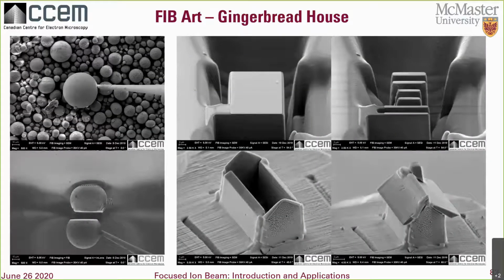So first, lifting and stacking large spheres is actually really hard. It helps to trim them a little, but still the deposition has a lot of trouble getting under deeply curved spaces. The house took a lot of planning to establish the size of the walls, determine the optimal construction order, how to do the roof pieces, how to make all 6 panels from one lift-out pit, and to nail the exact dimensions for each piece.